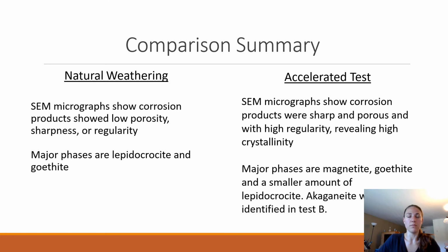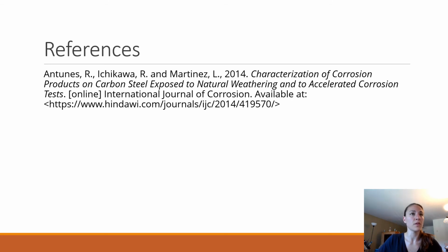And so most companies will continue to use these types of tests to validate suppliers and just to compare to old test results, just because there's a large history of old results to compare to. And here I just have the reference of that study.